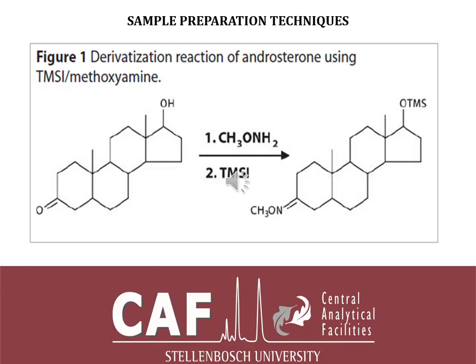organic solvent or whatever, from the water medium or whatever sample. And from there, the first thing that you do is you add the methoxyamine. What the methoxyamine will do is go and sit on the oxygen of the ketone, and then it takes the place where the oxygen of the acyl group will be, and then it makes that stable.